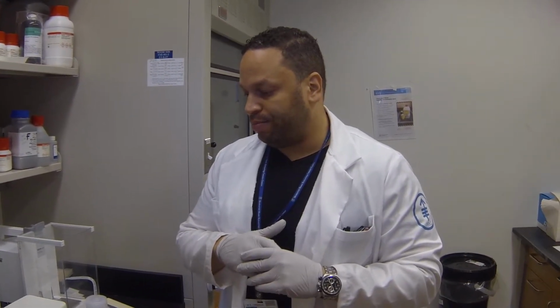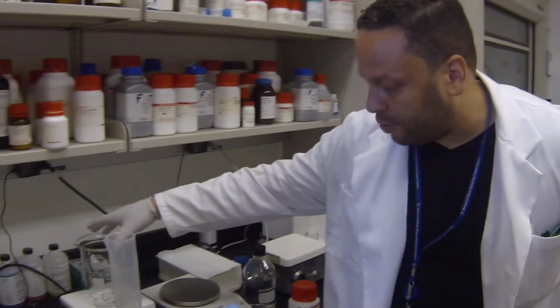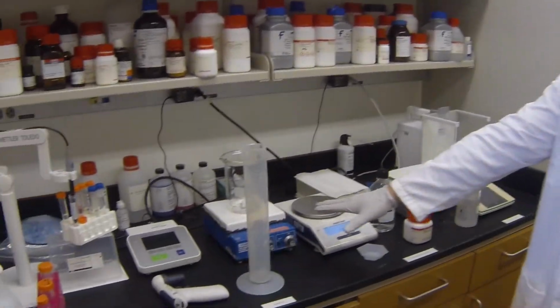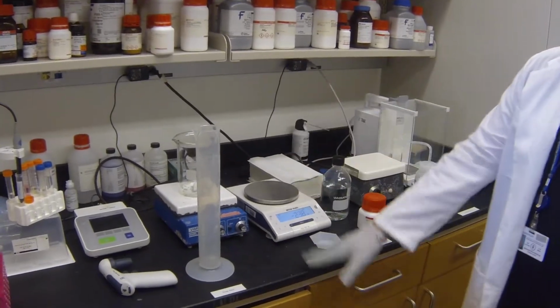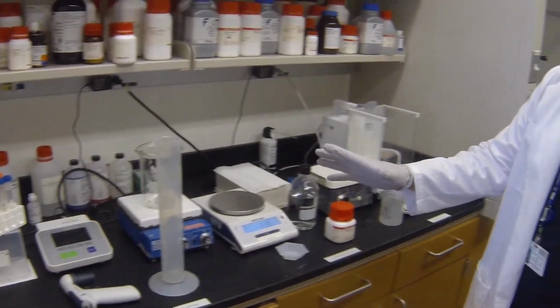Hello everyone. We're going to go over basic principles for making solutions at certain concentrations with certain solutes. One of the basic ways to begin is to make sure you have everything ready before you get started. Some of the things you're going to need are graduated cylinders, beakers, and magnetic stir bars over the magnetic machines that stir our solution and mix them.